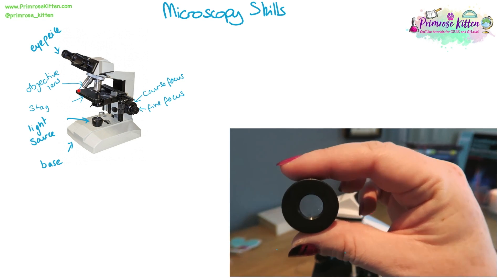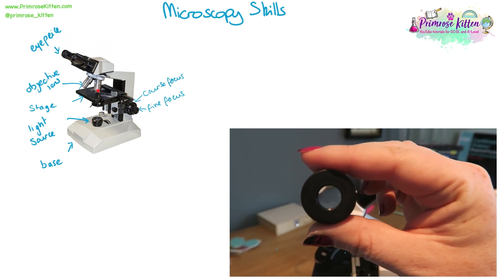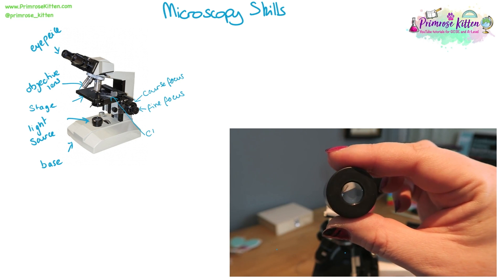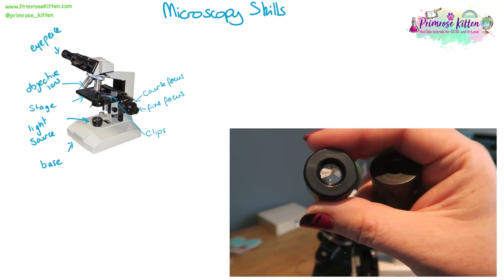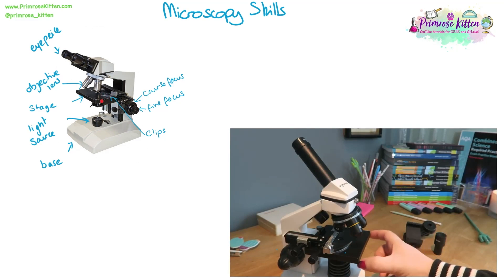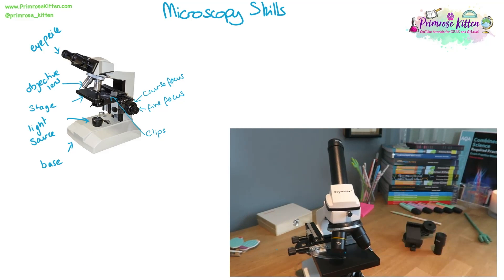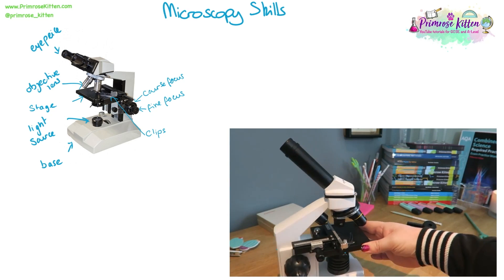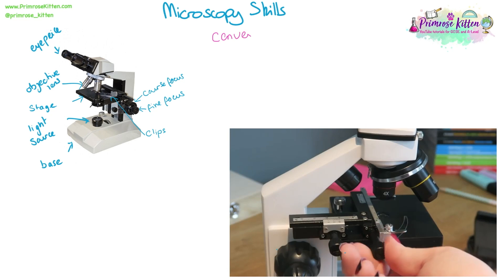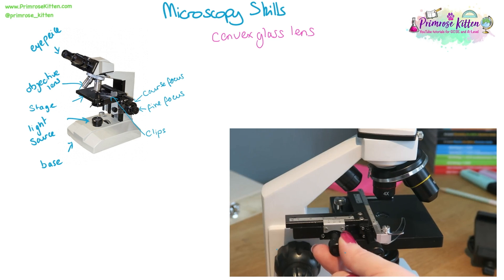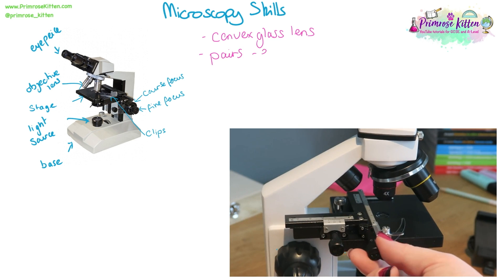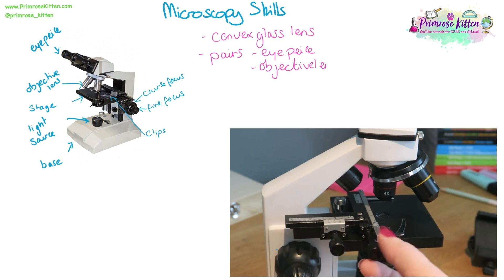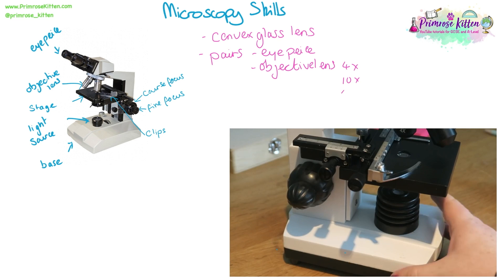This is your stage and you'll place your slide in here so that you can view it through the eyepieces. The slide is held in with this clip here which you can move in and out to put the slide in place and keep it there. Optical microscopes use a convex glass lens. It has a pair of lenses — the eyepiece and the objective lenses. These will generally be four times, ten times, forty times, maybe a hundred times.